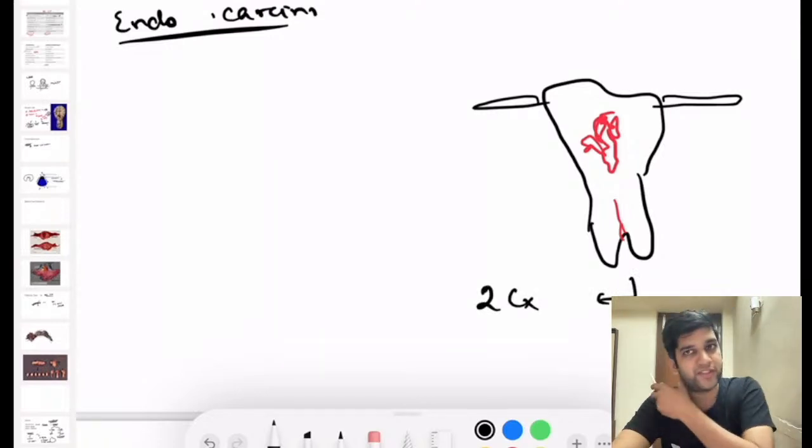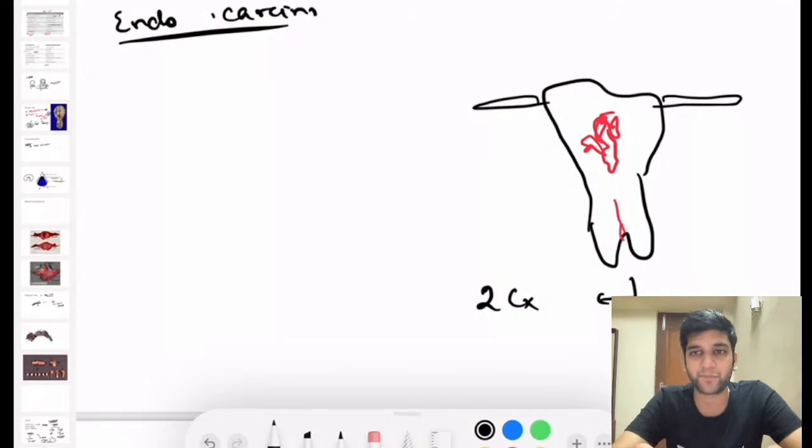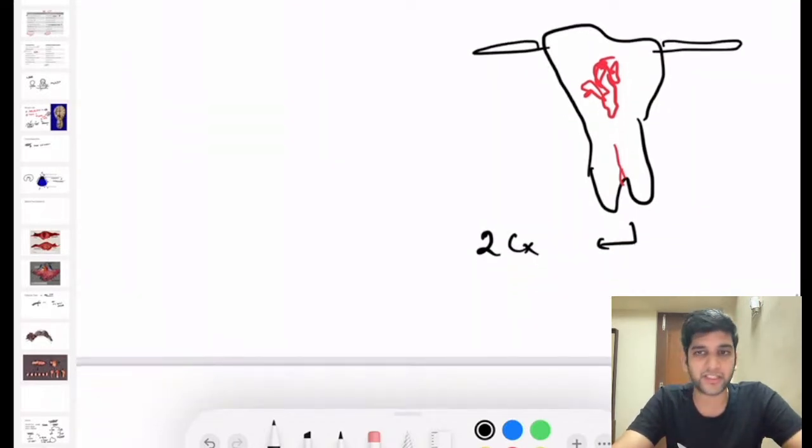Generally what we do, just for the sake of minimizing the sections, is we put both the cervical anterior lip and the posterior lip in the same cassette. Try not to do that. Give it in 2 different cassettes. That's more important. Sometimes for staging it might be required. Mucosa might not come properly if you give both in the same cassette, fine.